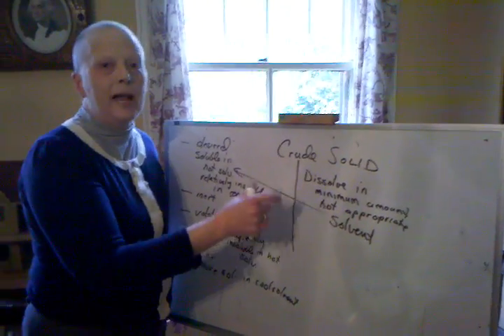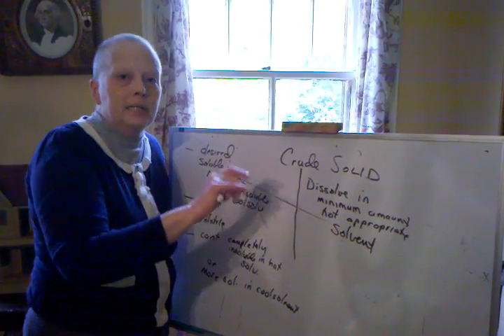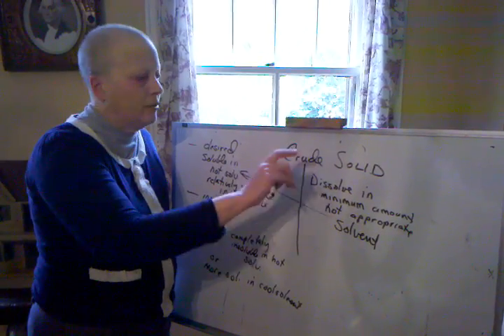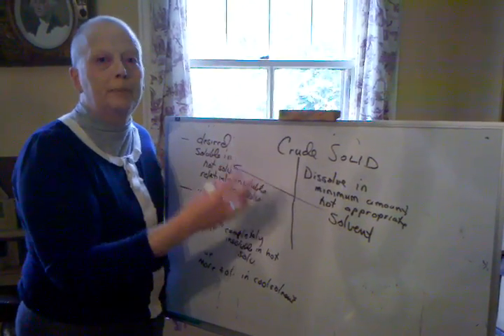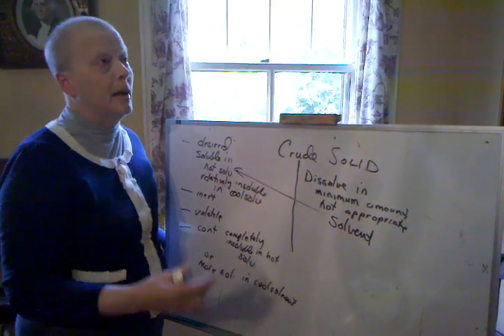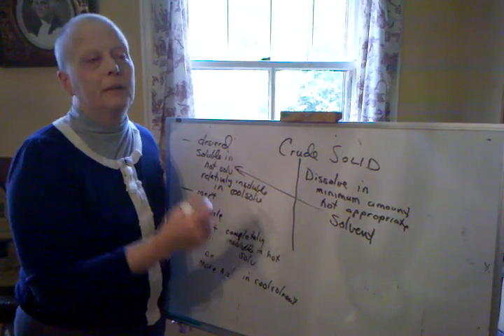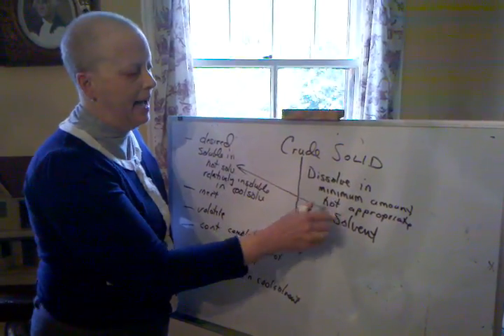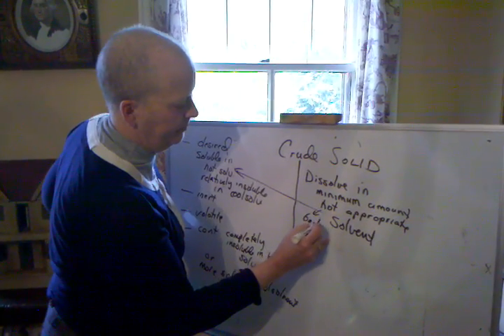And what you're doing is you're adding the solvent to your crude solid in increments, you know, boiling it and keeping it really hot, but adding it in increments until all that crude solid appears to go in, or it appears to not be changing anymore. Perhaps there's some ionic material in there that never goes into solution, but you would get to a point where you would stop adding it because you would feel like it was all in solution. Minimum hot, and I should say almost boiling. We're talking almost boiling here.